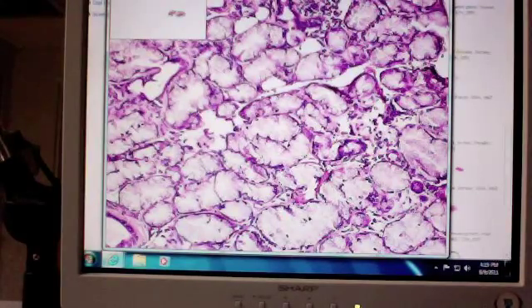All right. In this particular case, these cells are what kind of secretory cells? What are they secreting mostly? Mucus. All right. So name this gland. Mucus gland. Compound multicellular mucus gland, if you wanted to. Any of those would be correct. The original one we just said. Now, how do you know it's mucus? It's because these are very, very pale staining cells, and with very compound glands like this, if they're pale staining, they're going to be mucus secreting.